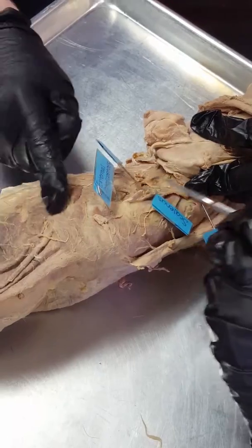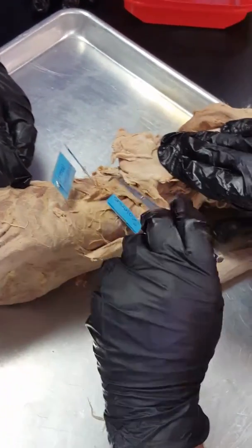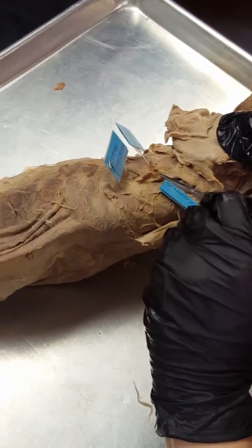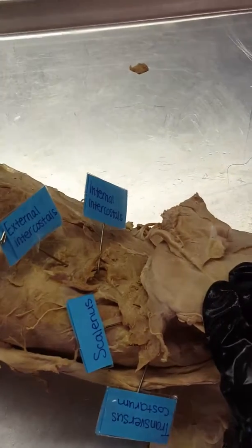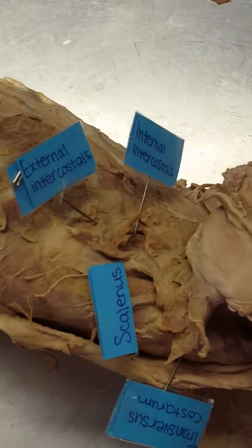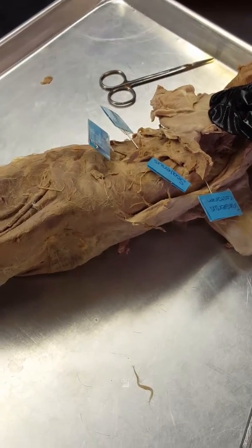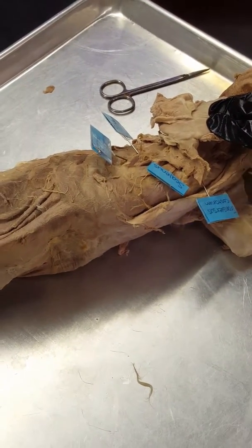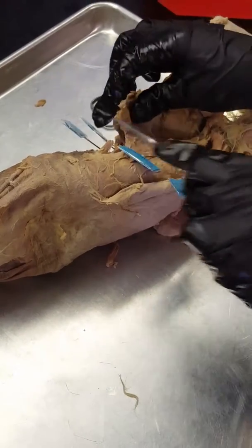The ribs are covered by the serratus ventralis. When it's flat, that right there is the externals, and when I lift it up that's internal — same as in humans. Be sure to get a photo of how I've ripped up one of the externals. You cannot see the internal until you've torn the external. When I tag it on the cat: if you see torn tissue, I've tagged internal; if it's smooth and not torn at all, that's external. Keep in mind there's a fan on top — that's the serratus ventralis that we cut and pulled back.